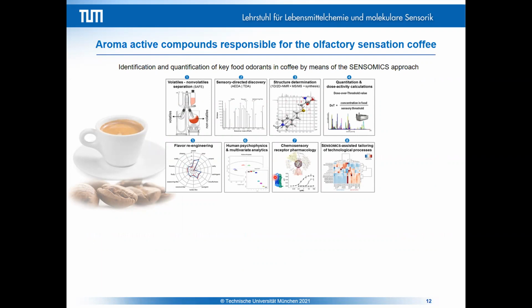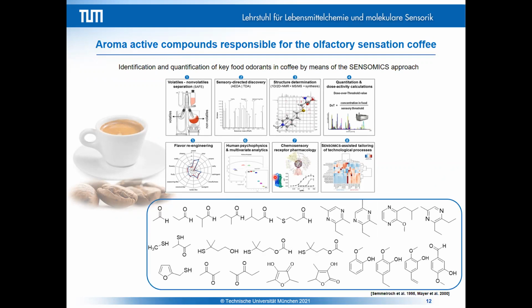And the actual molecules responsible for this olfactory sensation have already been elucidated by means of the so-called sensomics approach. And here at the bottom, you can see 25 so-called key coffee odorants. When you recombine them in the right concentration, this is what we commonly refer to as flavor reconstitution or flavor re-engineering, then you actually get the aroma impression of a freshly prepared coffee beverage.